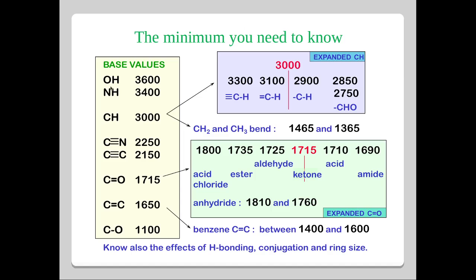Okay, OH shows vibrational frequency above 3000 centimeter inverse, or sometimes starts from 2500 centimeter inverse and goes all the way up to 3600 centimeter inverse. And NH, such as the one in primary amine or secondary amine, shows bands at 3400 centimeter inverse. OH is a very broadened band, whereas NH in primary amine is a W-shaped band, NH in secondary amine is a V-shaped band, or rather a U-shaped band. Then the carbon hydrogen vibrations usually come around 3000 centimeter inverse.